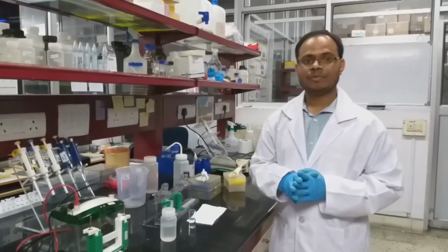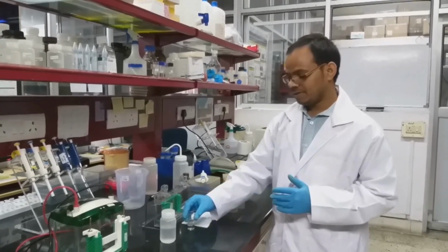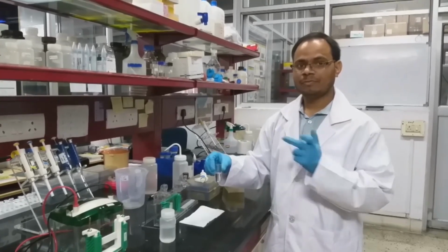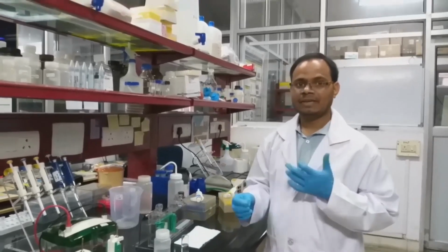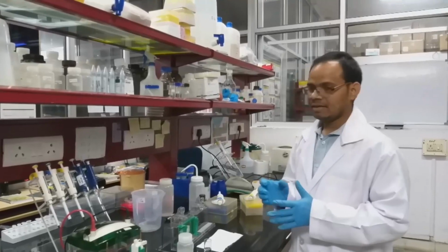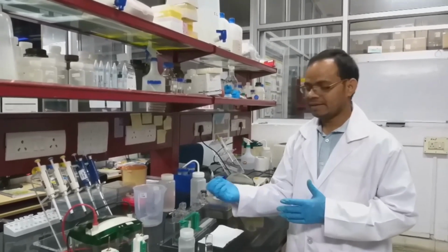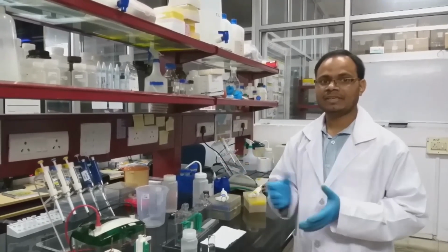In the final step, we have to add TEMED. After adding all the components, at the end of the gel, we have to add TEMED, because if you add it earlier, it will quickly facilitate the polymerization, so you cannot take it out with the pipette. It completely solidifies.